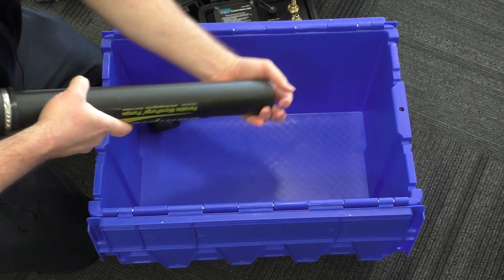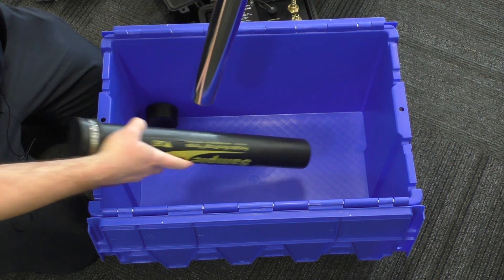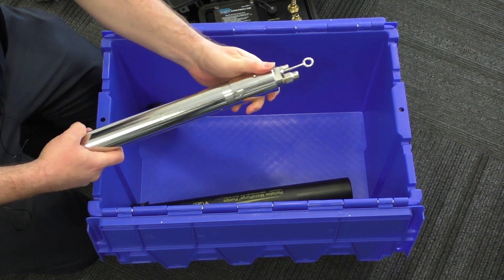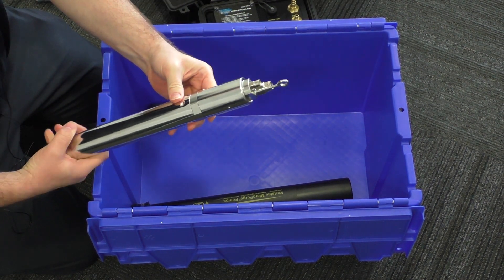And getting into the QED Sample Pro pump, stored in this little black case. We have that connected with push fit fittings to make it easy to install in the field.